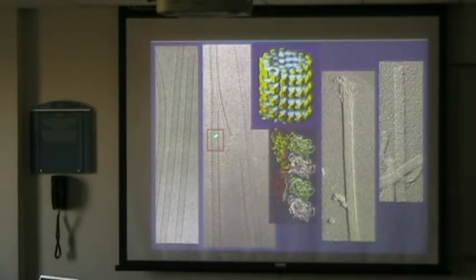And this is the same thing decorated with these motors. So we have these teeth again, and these teeth here, they show up as little lines going in this direction. So you see they cover entirely the protofilament, so we don't see the protofilaments anymore. Now we have this overlaying lattice which comes from these molecular motors, like in this case here, if you wish. So we see these lines, so to say. And in this case, we see these underlying protofilaments as a dominant feature.